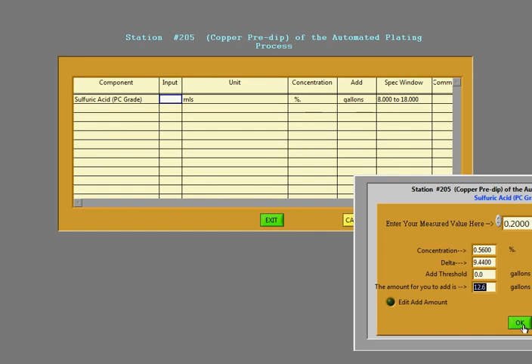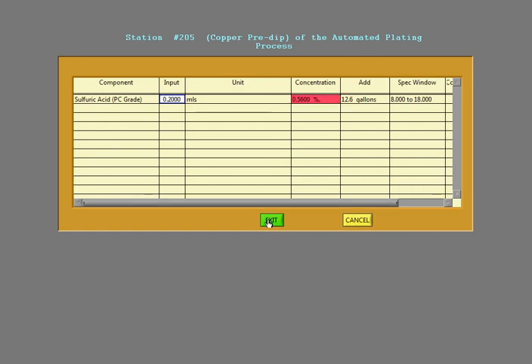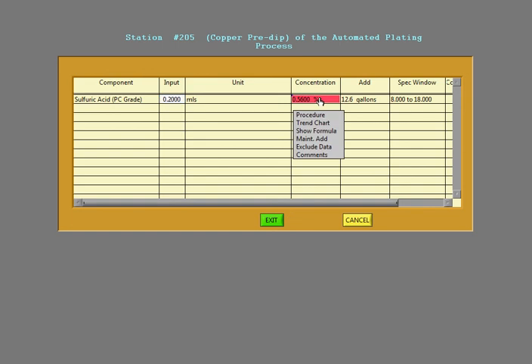After the technician does this, it summarizes right here what was found. And it's saying you have a couple options here. It gives you a procedure. You can go to a trend chart, a show formula, maintenance add, include data, and comments.